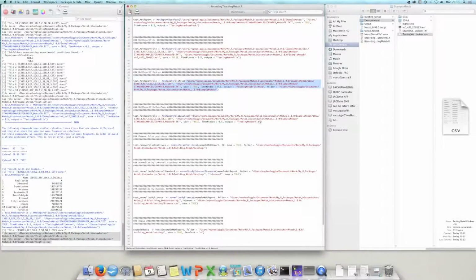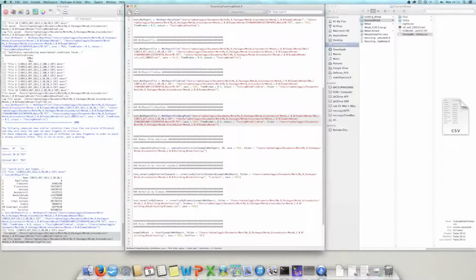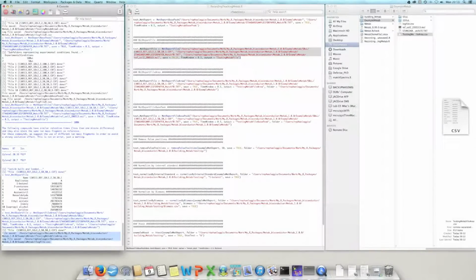If you perform exactly the same analysis that you perform now, but now using the base peak instead of the area. So let's change here, testing file base peak. You must have a pretty similar result as the one we had for this function here, which is these results here, those abundances.